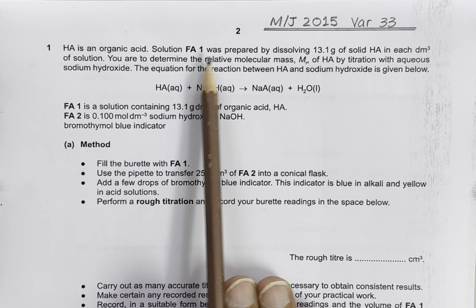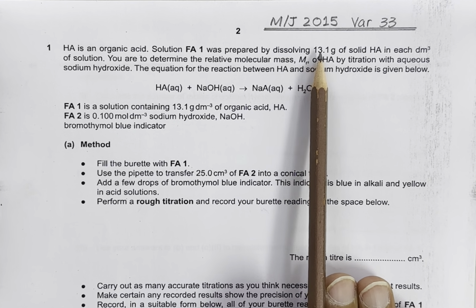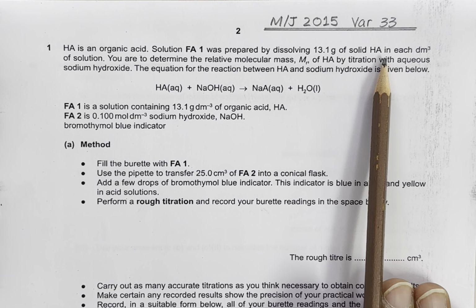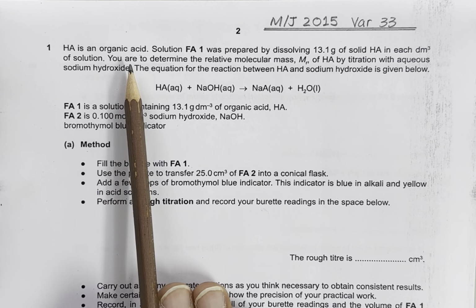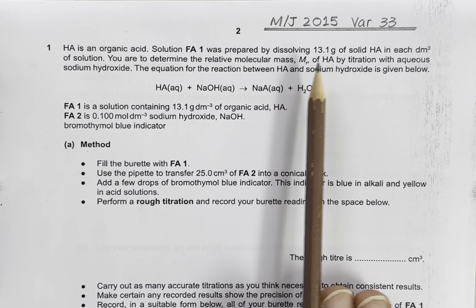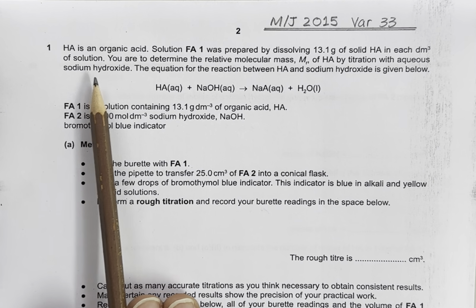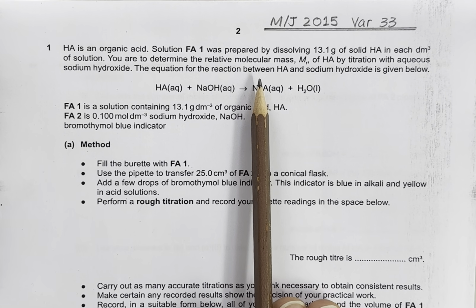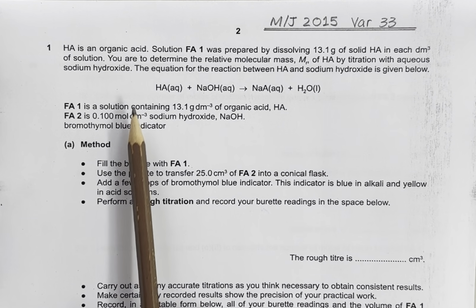Solution of FA1 was prepared by dissolving 13.1 grams of solid acid in each decimeter cube of solution. You are to determine the relative molecular mass Mr of the acid by titration with aqueous sodium hydroxide. The equation for the reaction between acid and sodium hydroxide is given below.